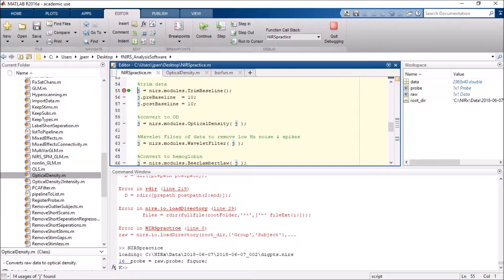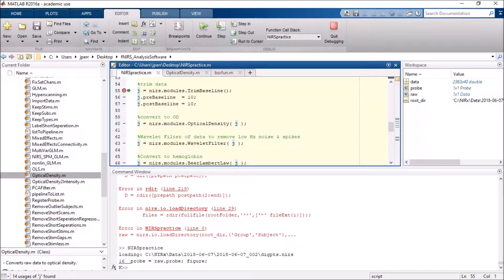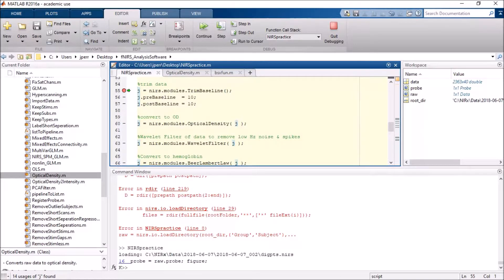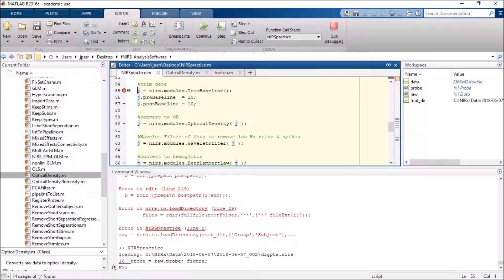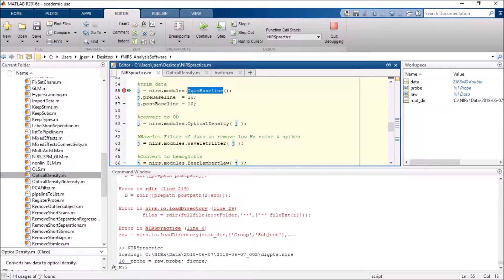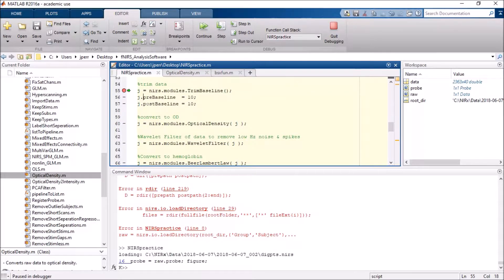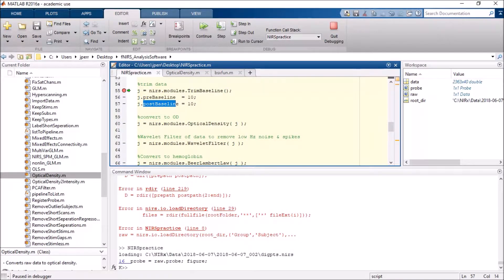the next step down I'm actually going to convert my data to optical density. And you'll see basically I rename the job, and it creates a new list of jobs as it goes along. So J starts as an empty job, so it starts the new job. The pre and post baseline are designated, and then from there I'm adding jobs in.